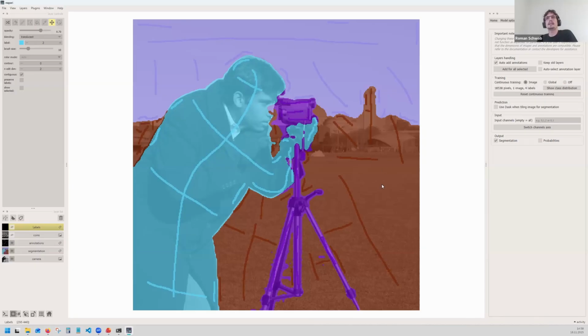So for example, here it's not good because we're using the vision transformer. But if you're using a CNN and you go here to the annotations and add this little bit of annotation, originally, without continuous training, it would extract all the features for all these annotations again, so basically the entire image.